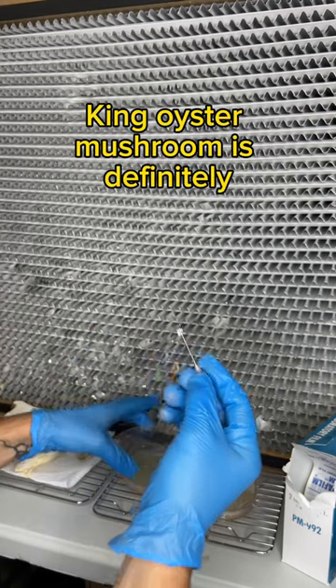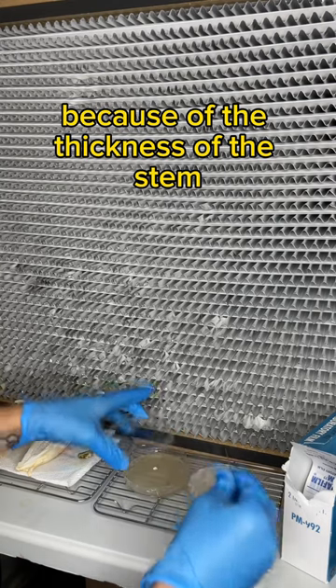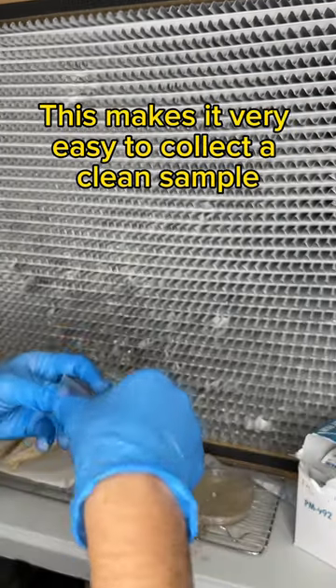King oyster mushroom is definitely the easiest mushroom that you can clone because of the thickness of the stem. This makes it very easy to collect a clean sample.